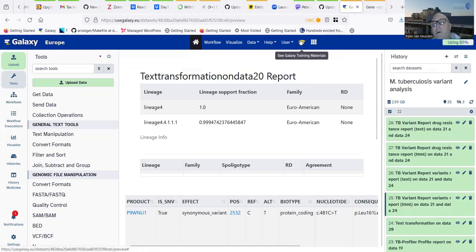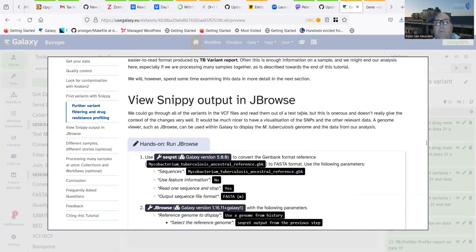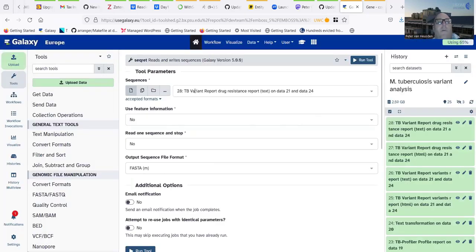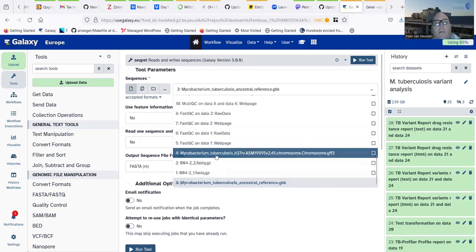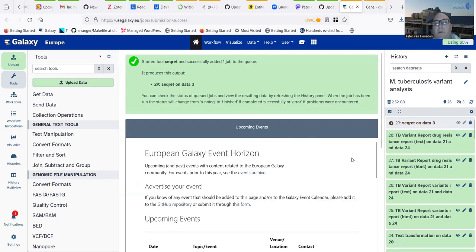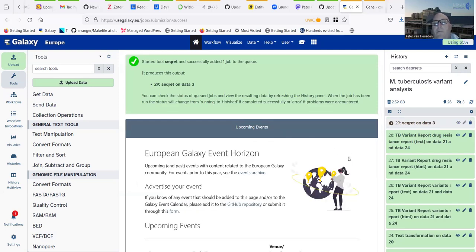Moving to the next and final parts of the main tutorial: we have all this information about variants and drug resistance, but what if we want to look at the reads and how they provide evidence for this in more detail? For that we use a genome browser called JBrowse. First we need a FASTA format version of the reference genome, so we use the tool Seqret for format conversion — accepting the GenBank file and converting it to FASTA.